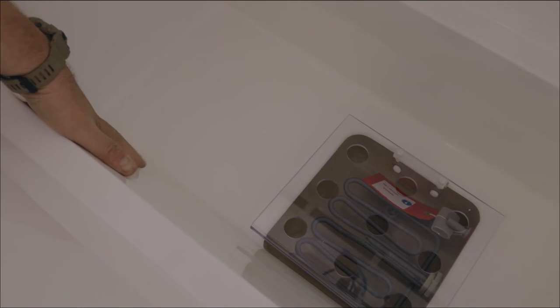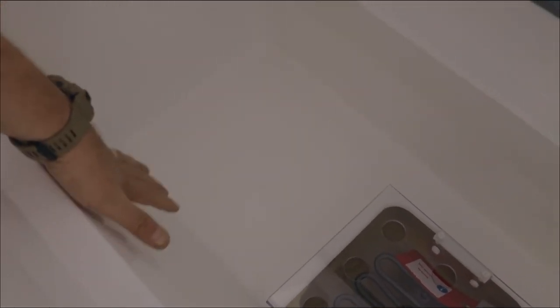On the outside of the floor and walls of the chamber we have bonded silicon heater mats for generation of heat.